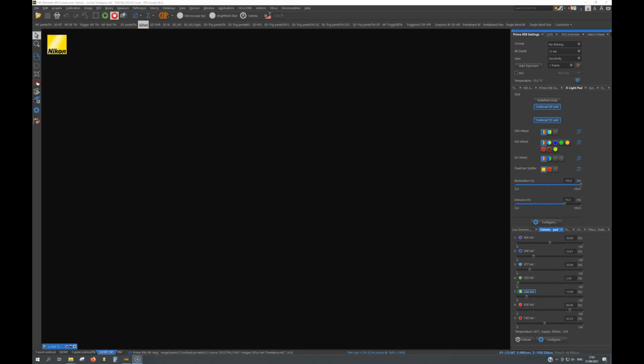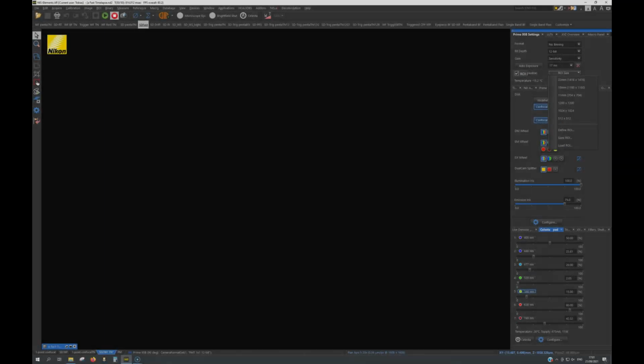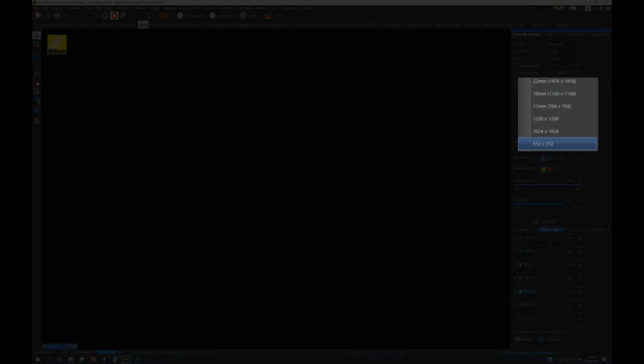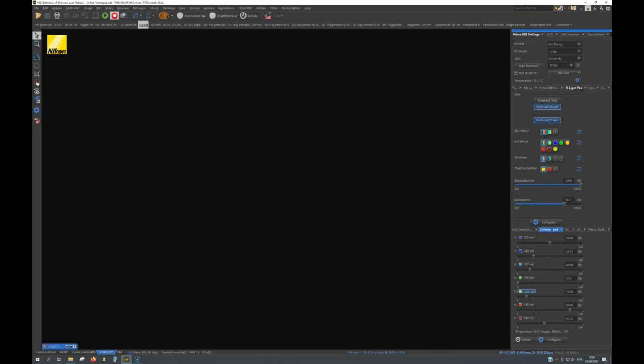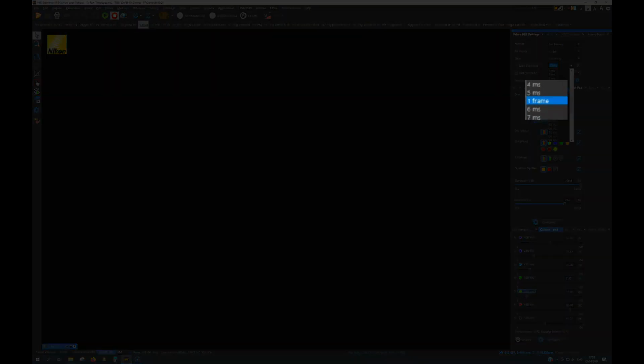For later comparison, we will now acquire stacks using a region of interest. From the drop-down list we will choose the 512 by 512. We will also need to reset the 1 frame, as the limited ROI will take less time to image compared to the full frame. You can see that the 1 frame acquisition time is now between 5 and 6 milliseconds.